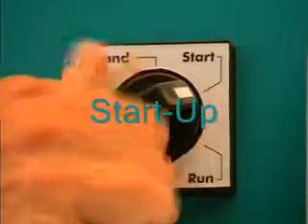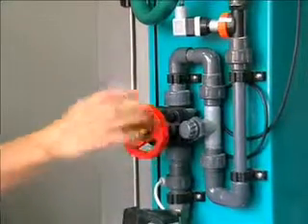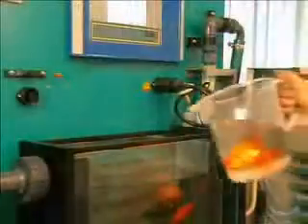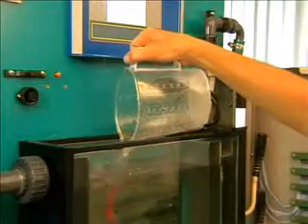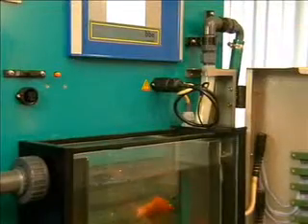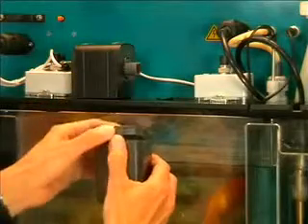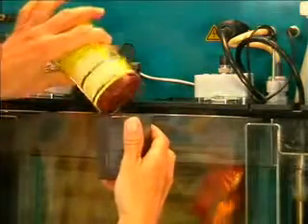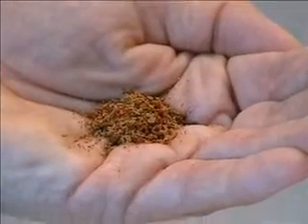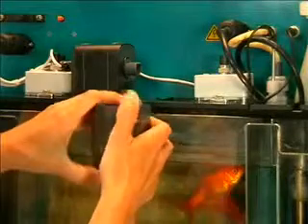The Startup mode is used to prepare the instrument for operation. Open the flow control valve and allow the prepared water to enter the aquarium. The fish should be handled as carefully as possible. Transporting the fish, if only for a few metres, should be carried out using buckets or plastic containers. Avoid deviations in temperature. The automatic feeder should also be checked and refilled if necessary. Dismount the front part to refill it. The food has to be of an appropriate size, structure and composition. Granulated, dried food of 0.5 to 2 mm in size is recommended.